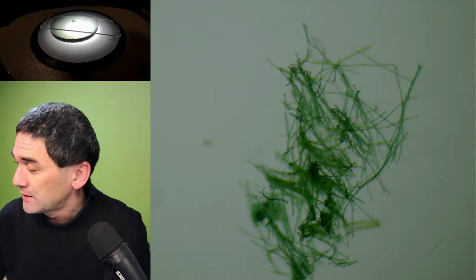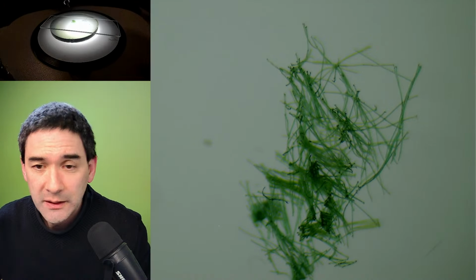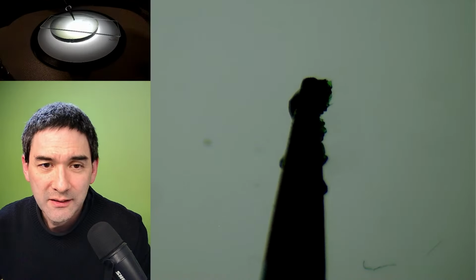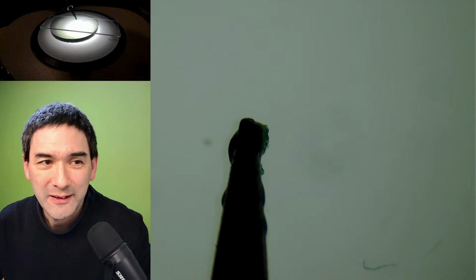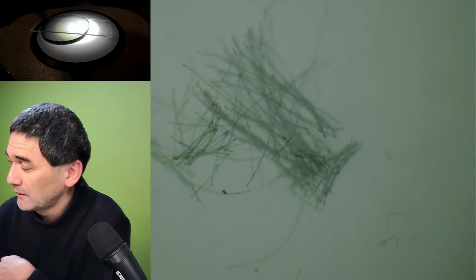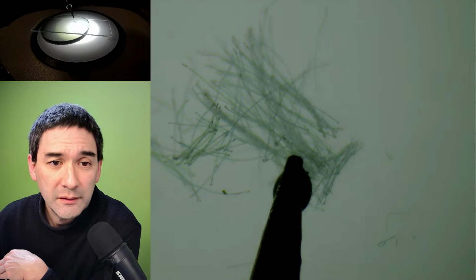If you touch the individual fibers, it is way too fast. It melts, obviously. That was a very quick response.